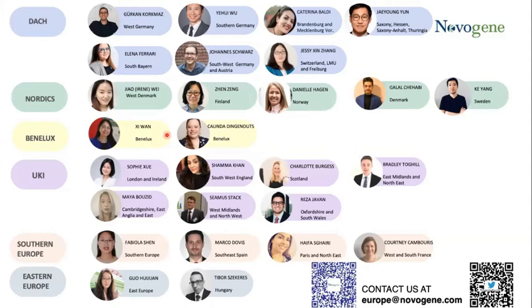Okay. Brody Fecker has asked, do you accept PCR products instead of nucleic acid for RNA sequencing? For RNA sequencing, what we normally accept is total RNA. We do have some experience with customers who send us complementary DNA after they perform reverse transcription. But for PCR products, it will need to be evaluated. We need to see exactly what the purpose of the study is.